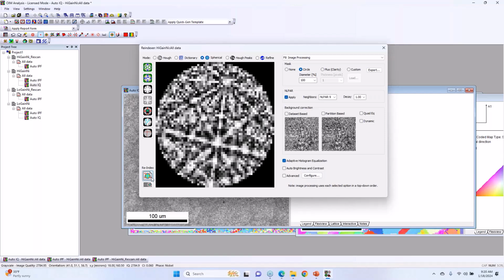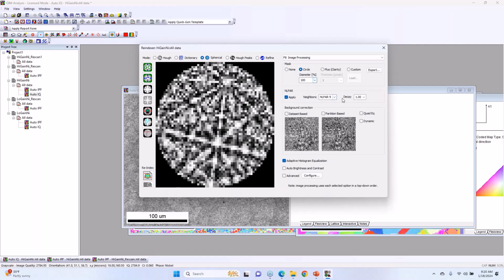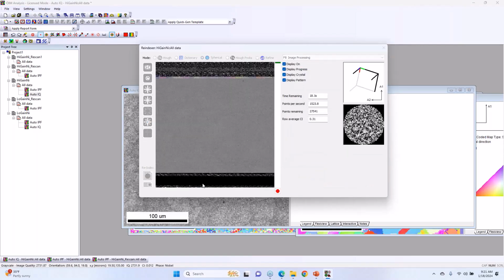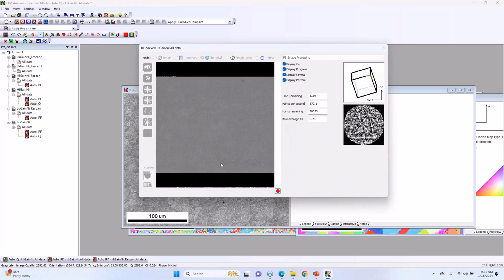So I can have the NLPar turned on, I hit reindexing, and you see NLPar at the highest level has a pretty significant time penalty relative to where we were going before. But if we come here and say 2, it goes faster, and then NPar itself should be pretty quick.